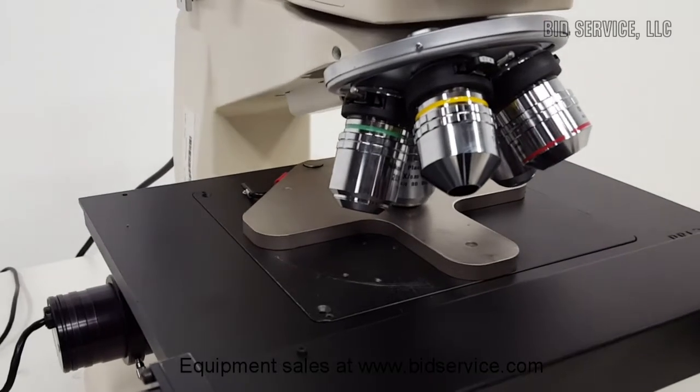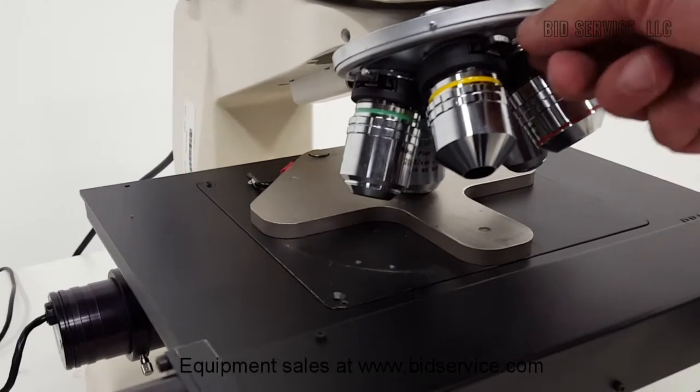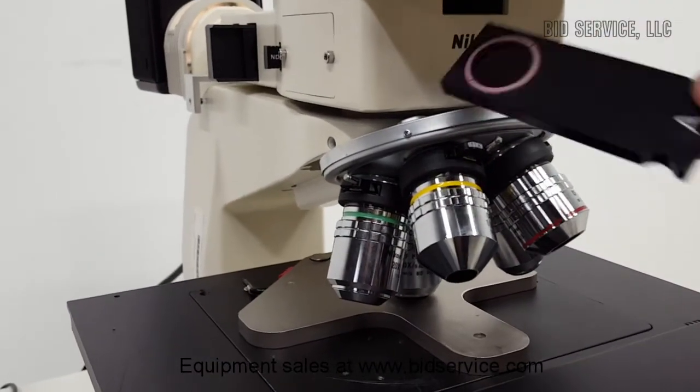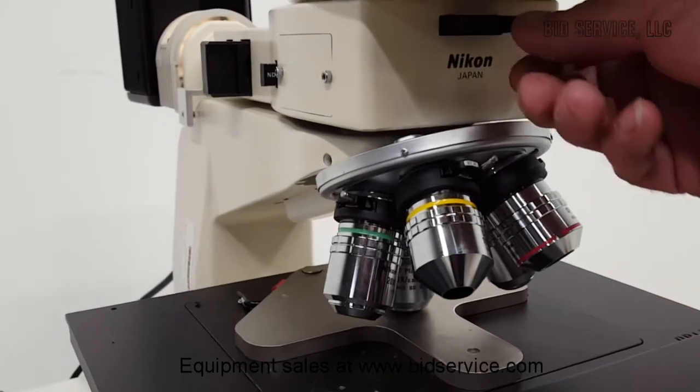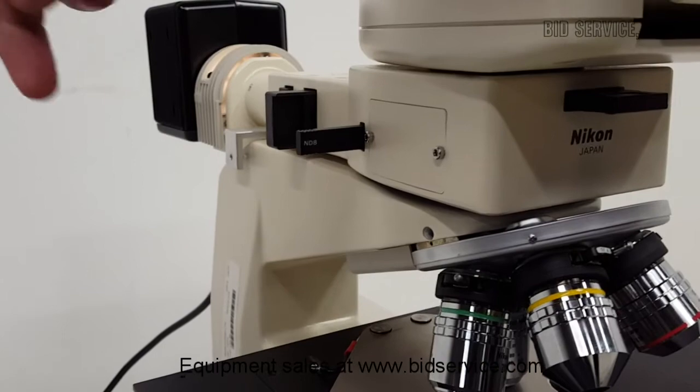The 10 and 20x objectives are Nomarski. There's the prisms. Up here is the analyzer. And on the side here we have a neutral density, 8.